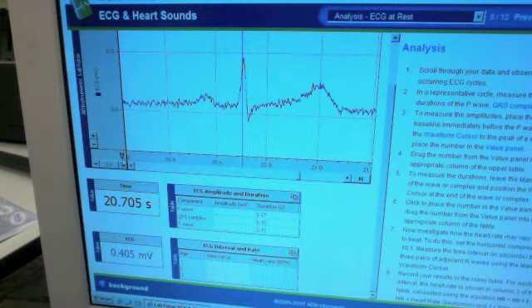Now, there's a nifty way you can do that, and that is to take this little thing that looks like an M, which stands for marker, and this allows you to set a baseline. So it's kind of where your thing would home. I'm going to put it right about here, which looks to be the right place for it to go, since things are going up and down. I put it there. And then this little bar, as I move it, will tell me how far away I am from that baseline. So here I'm about at the baseline.